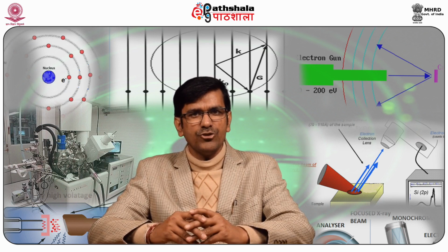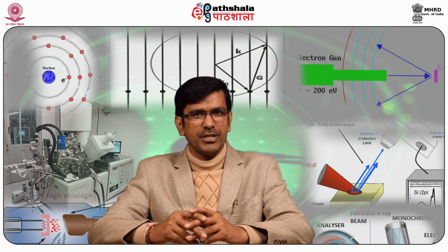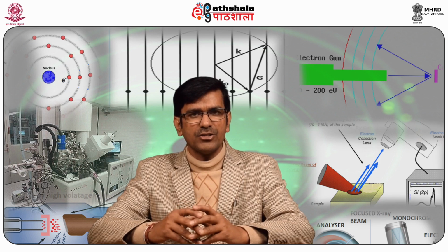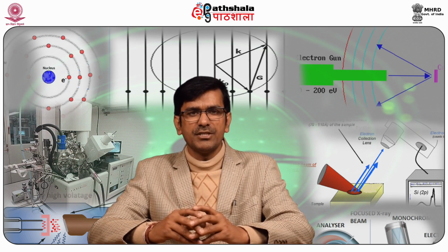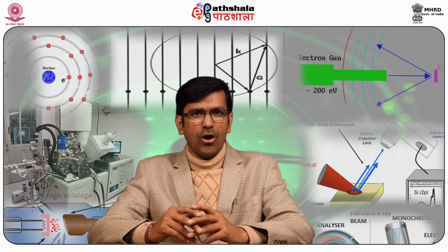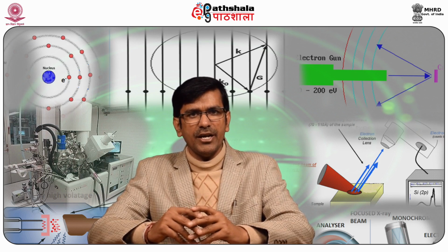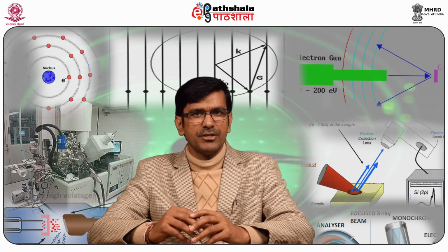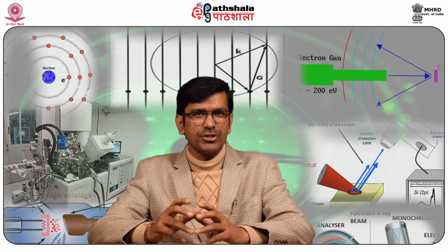Steps can be taken to improve the resolution, but there are some methods that sacrifice other parameters such as the sensitivity. Obtaining high spatial resolution and high energy resolution always comes at the expense of signal intensity. Methods to improve resolution are as follows.